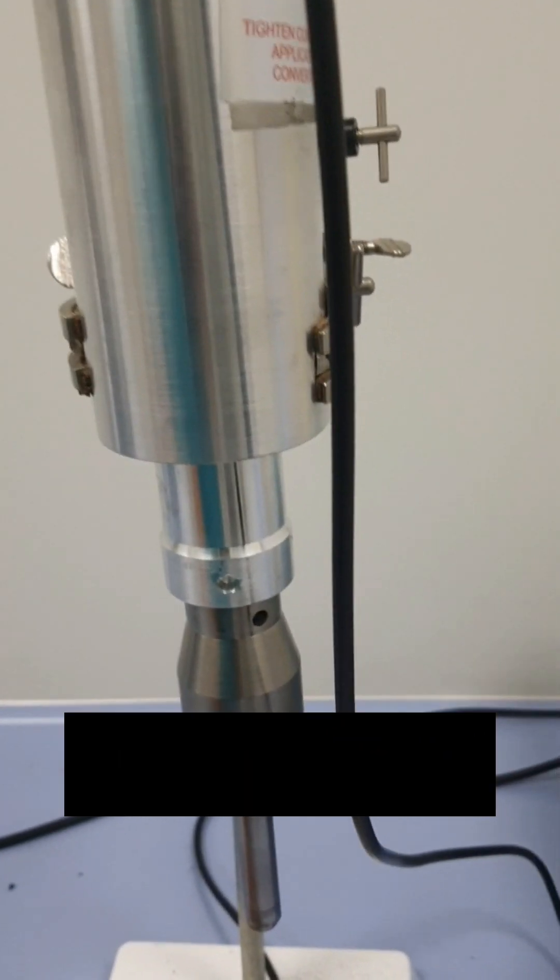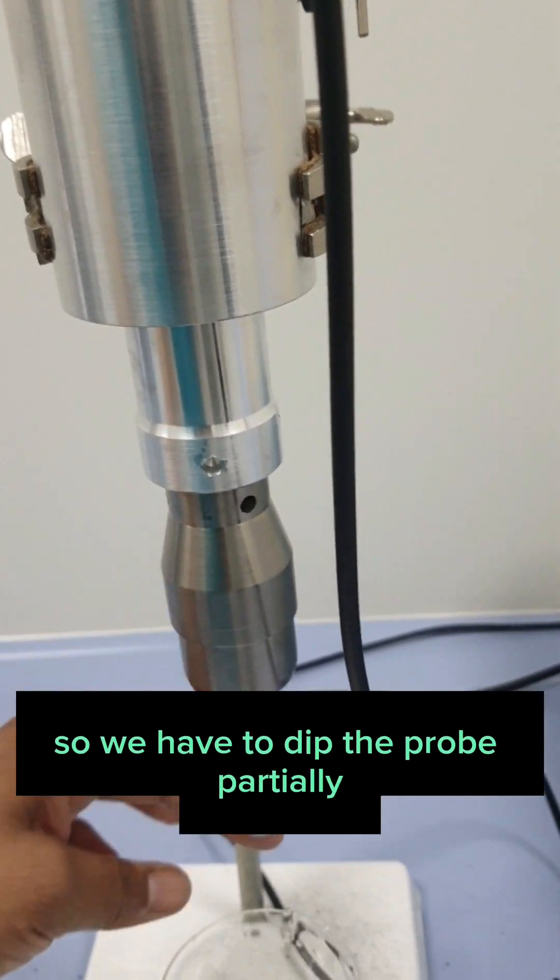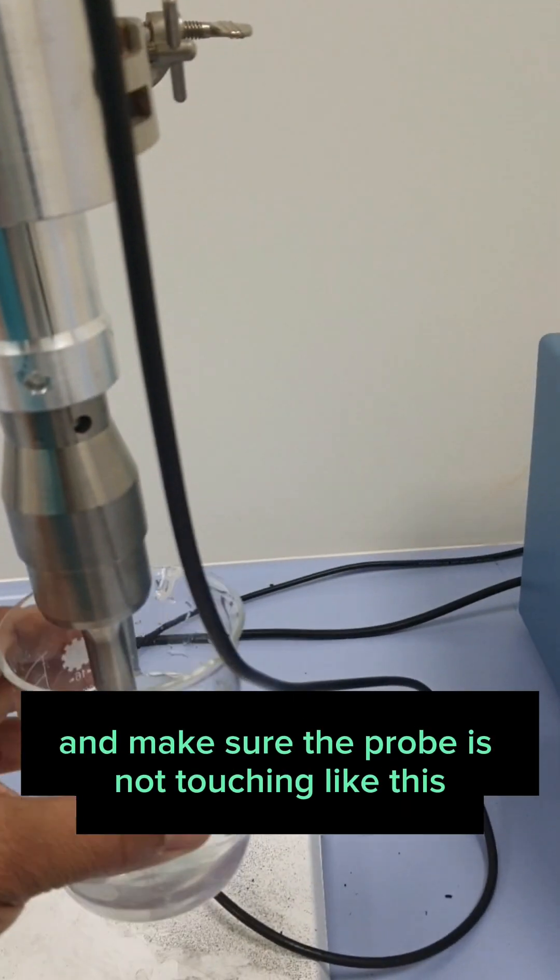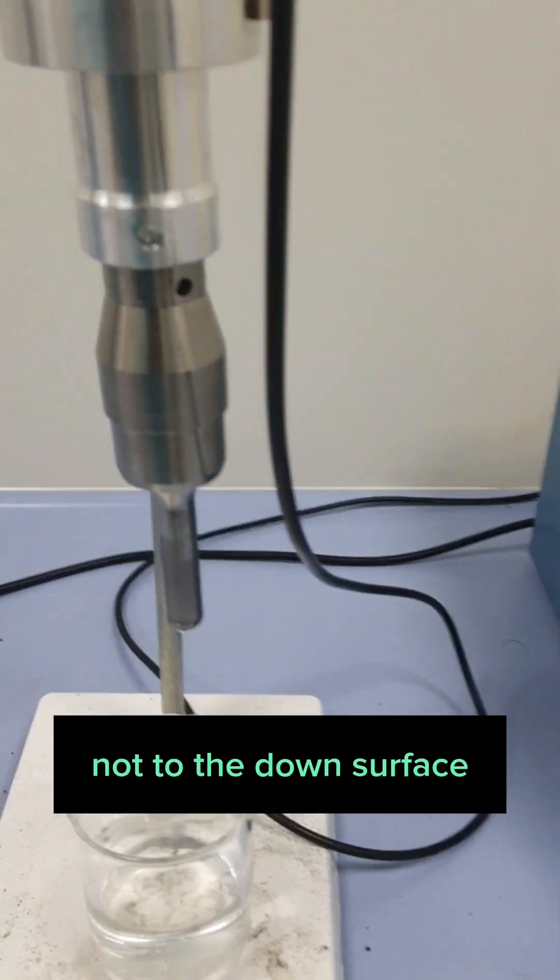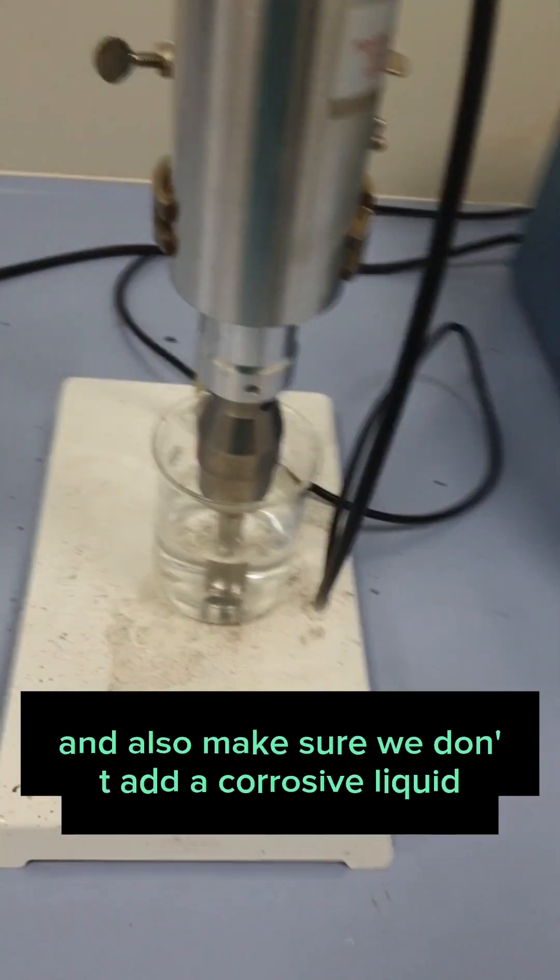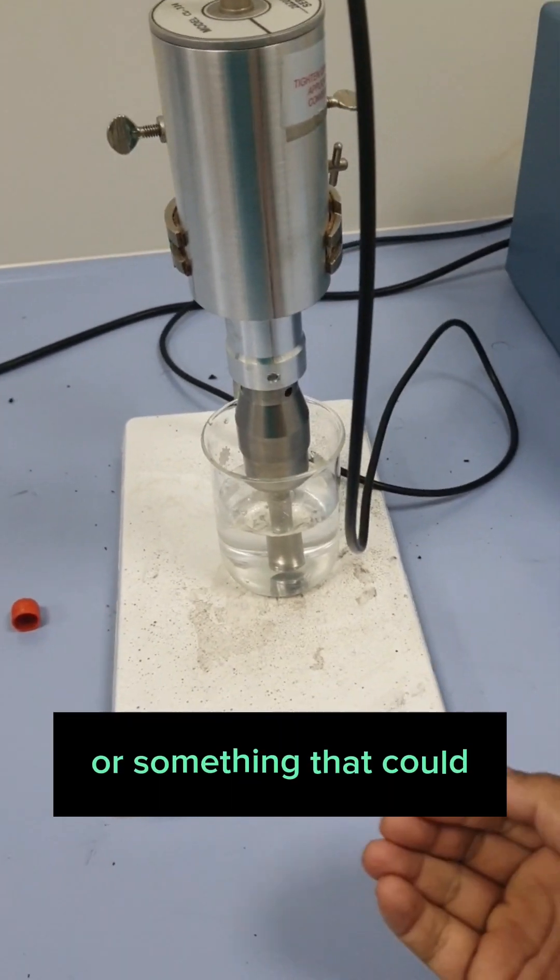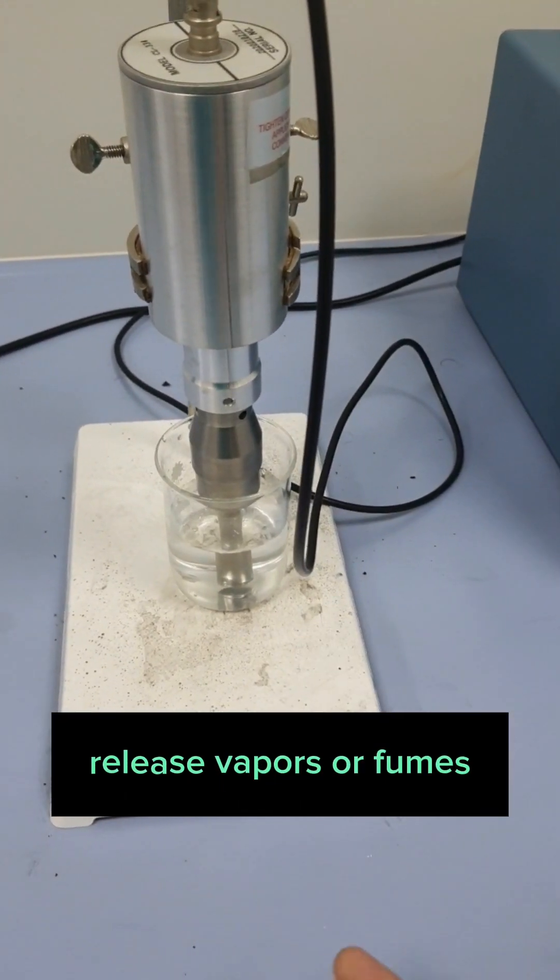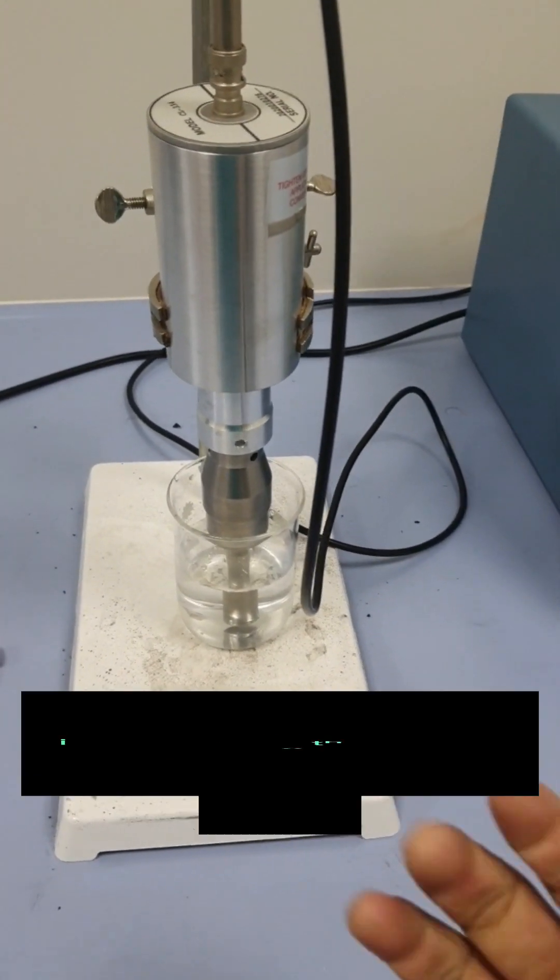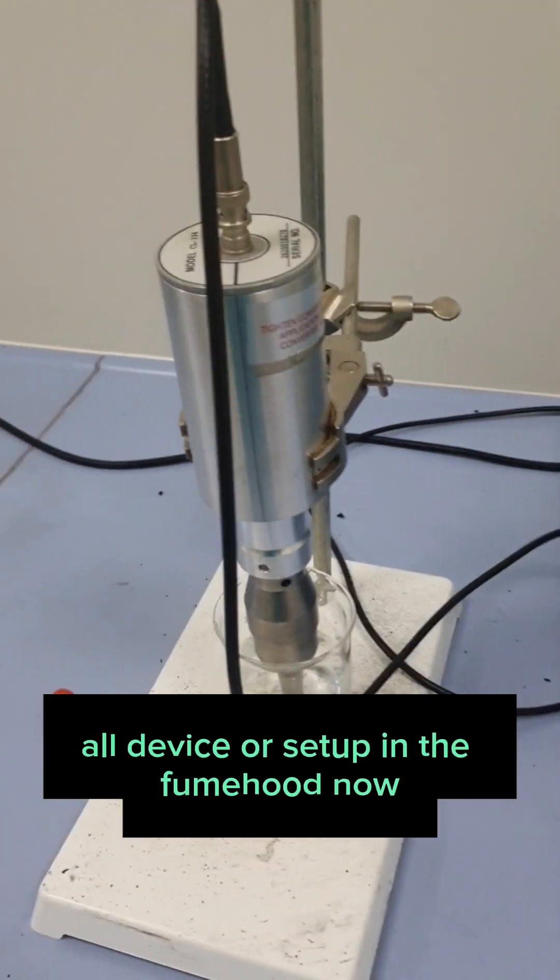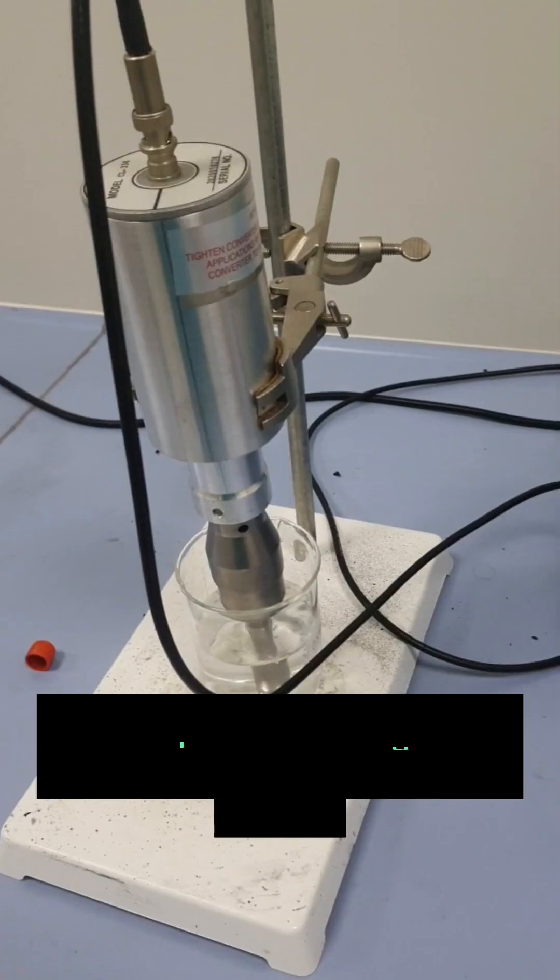Putting the probe down. The probe is now up. We have to dip the probe partially and make sure the probe is not touching like this, not to the down surface. Also make sure we don't add a corrosive liquid or something that could release vapors or fumes. In that case, if you are using that kind of liquid, we have to use this whole device or set up in the fume hood.